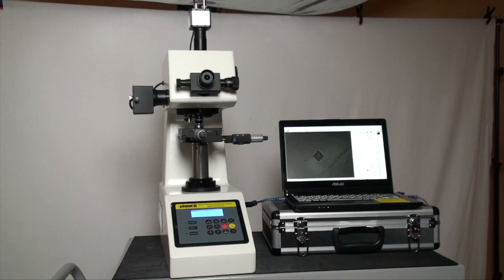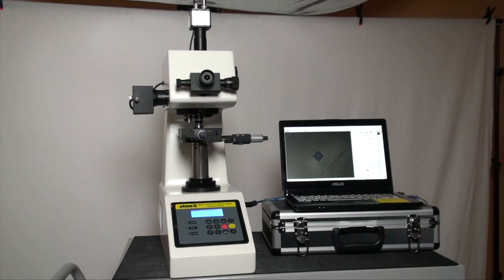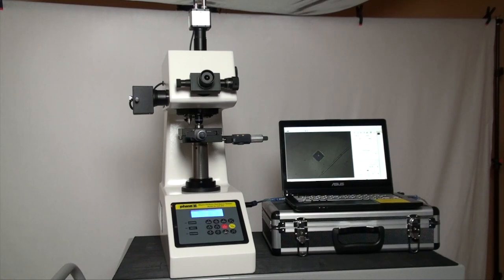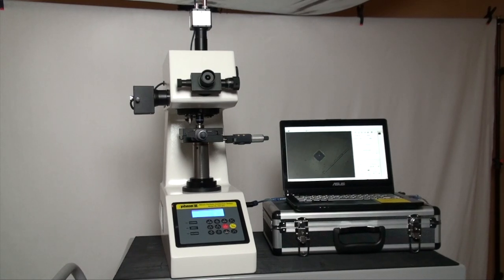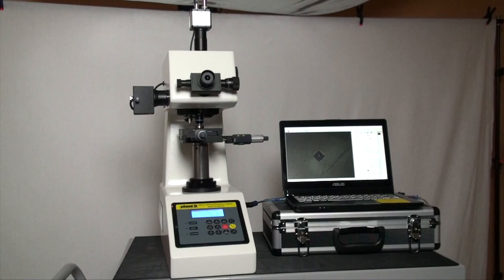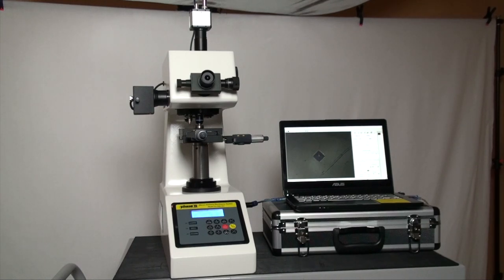Now let's move over to the operation of the hardness tester and see how easy it is to utilize the different functions, taking tests and obtaining results. First, when powering up the machine, keep the number one button depressed until the PC link shows on the machine screen.